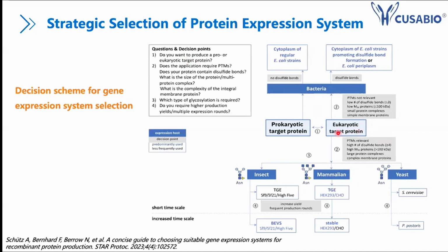Because for eukaryotic proteins, if the proteins require complex post-translational modification, then with the E. coli expression system you will have a lot of problems. I know that in the market there are already some commercial strains, but I will say that it's hard, because even with the commercial strains, they only enhance the ability to form disulfide bonds, not all types of post-translational modification. So in this case, I will recommend directly using a eukaryotic expression system.